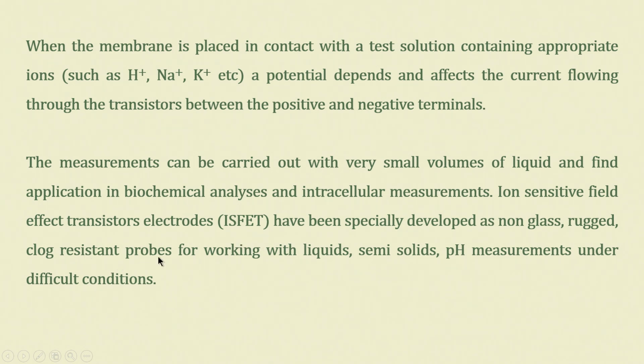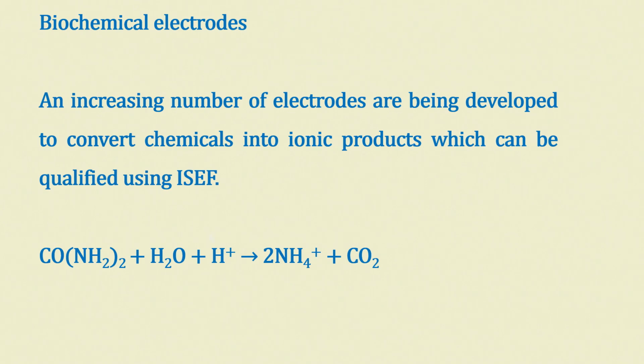Such probes are required for working with liquids, semi-solids and pH measurements under difficult conditions. So, ISFET and MOSFETs are among the recent innovations in ion selective electrodes.